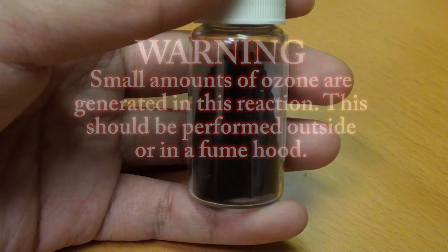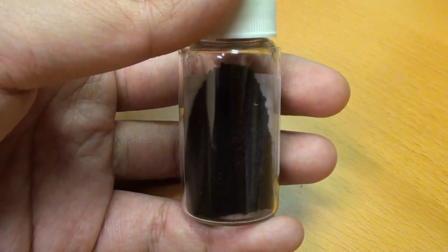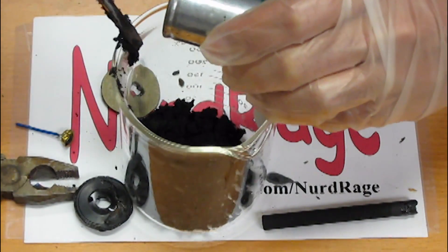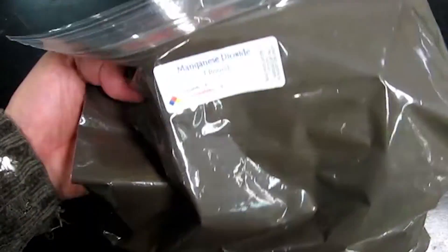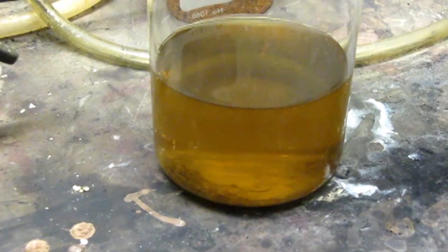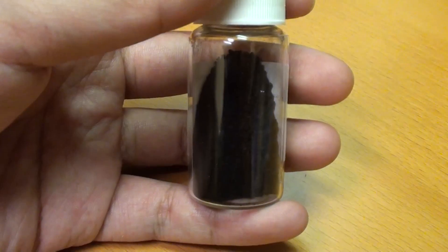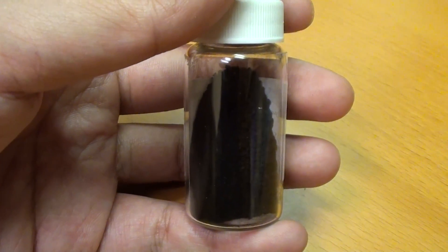Greetings fellow nerds. In this video we're going to make high purity manganese dioxide. Manganese dioxide is already widely available in battery sludge and pottery glazes, although these sources are notoriously impure. This often isn't an issue for most reactions an amateur would try. Nonetheless, we'll be making high purity manganese dioxide to explore the science.